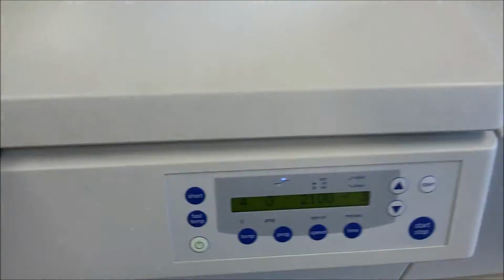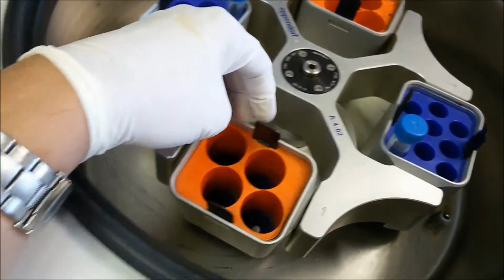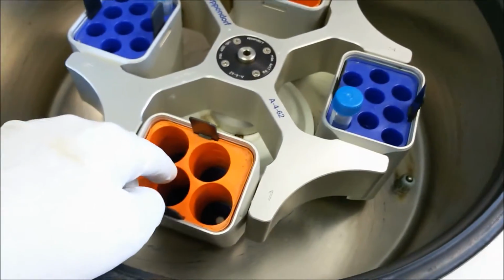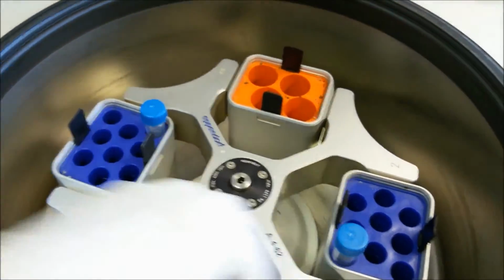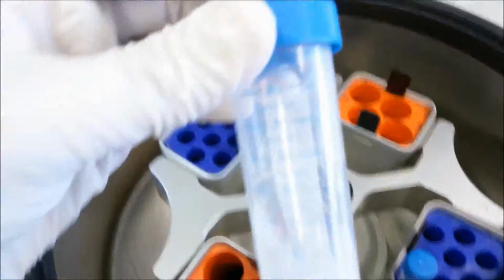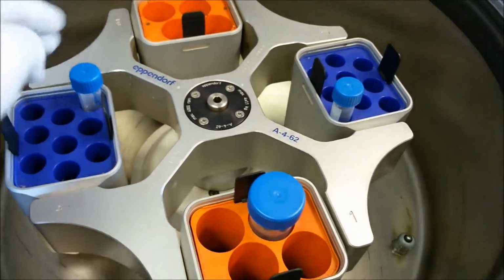Okay, so we open and have a look at it. So you can see this is quite big. Let's see if you can see this. So this is balanced one, right? So this is for the 50 ml tubes, and this is here for 15 ml. This is 50 ml. So this is for the bigger centrifuge tube. So this is a big tube which you can put here. Yeah, and the same time it's the same way you can use it.